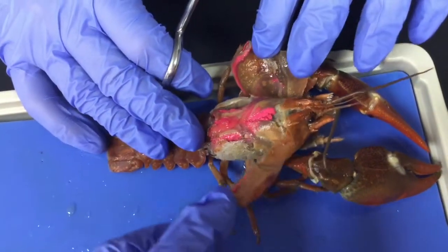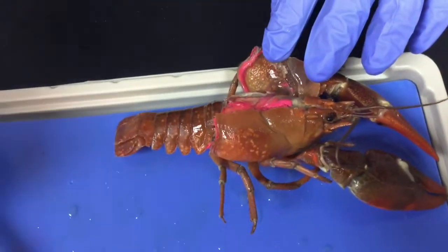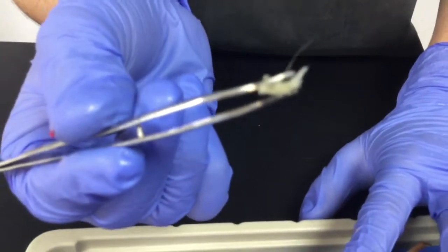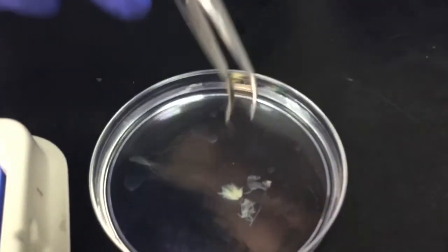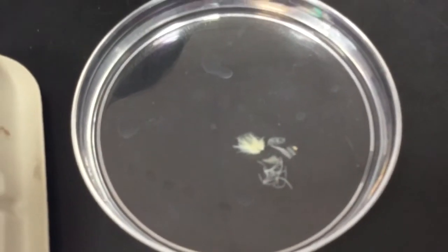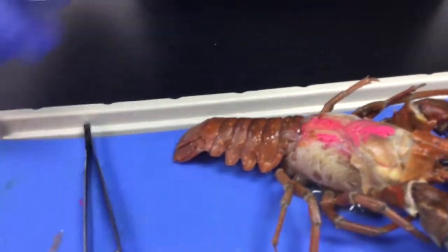Gross. Yeah. And the pink in there is a dye I've had. Okay, these are the gills. They're kind of feathery looking. It doesn't rip out. That was a fail. We're going to put that into that petri dish of water and observe. Ooh, look at. I think so. So you can put more in if you want. Well, I failed, so.